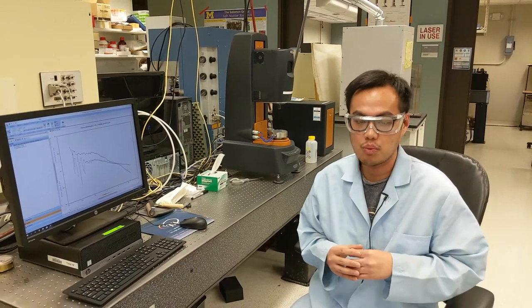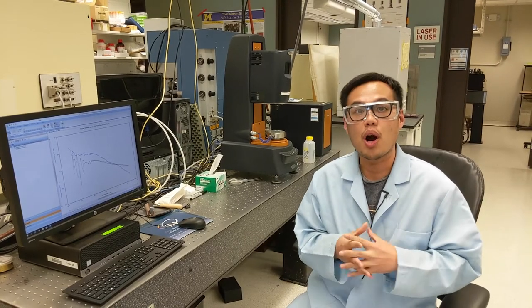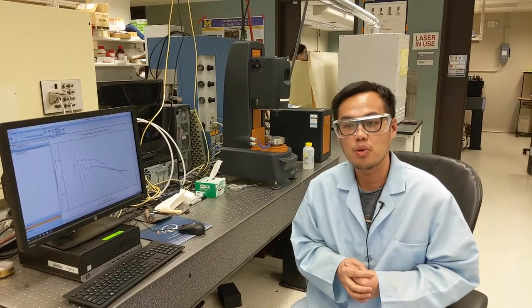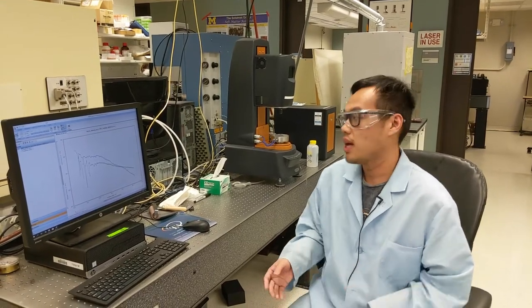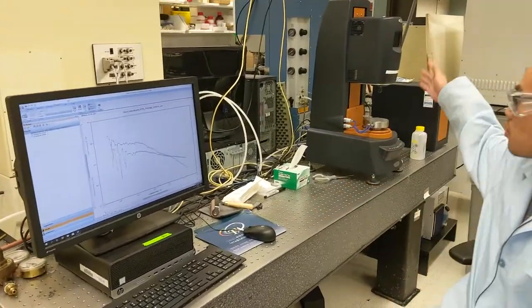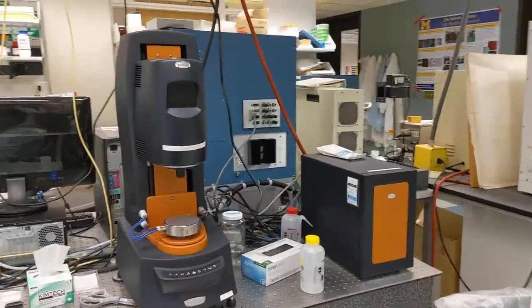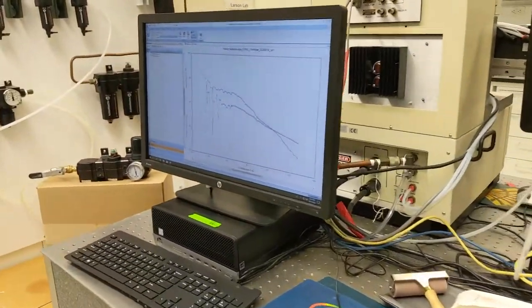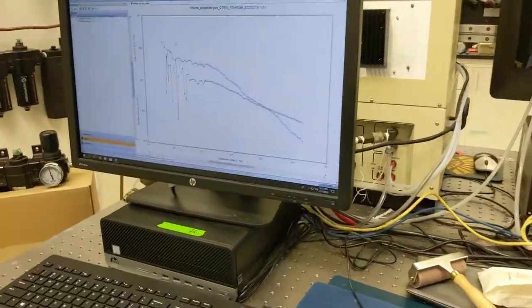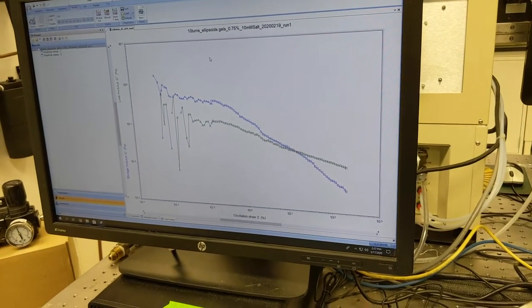Okay, I would like to talk about my project about minimum gels. So the idea is we change the shape of colloids and then see if the interaction between particles becomes stronger, so we can use much less particles to make a stronger gel. And to measure that, basically we are using a rheometer here. The data here will show the modulus and the oscillation strain. So basically, if you see a much stronger modulus, that means that the gel is stronger.